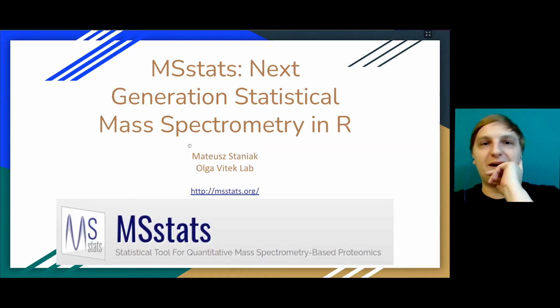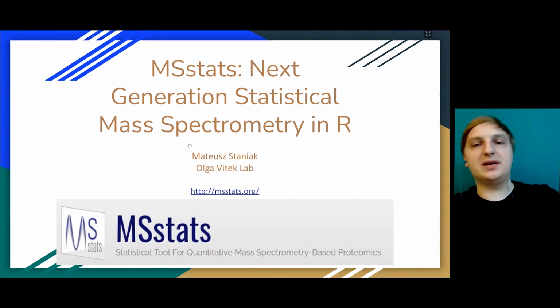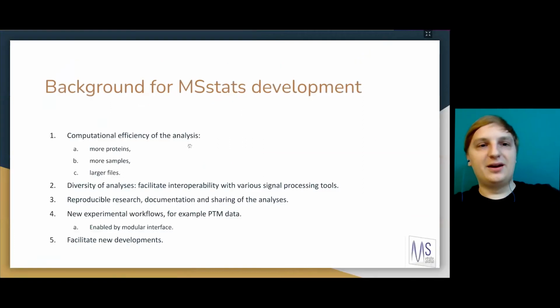So Matt, you're up next. So I'm Matt again. I was lucky to join the Olga Vitek Lab thanks to the CZI funding. MSstats and Cardinal, Next Generation Statistical Mass Spectrometry in R was the title. Here I will be presenting just the MSstats part of the project.